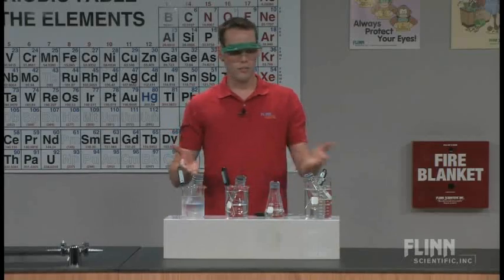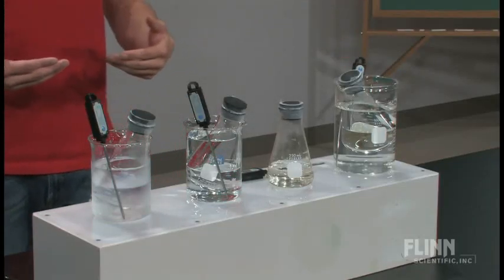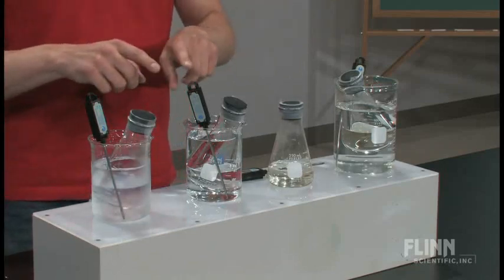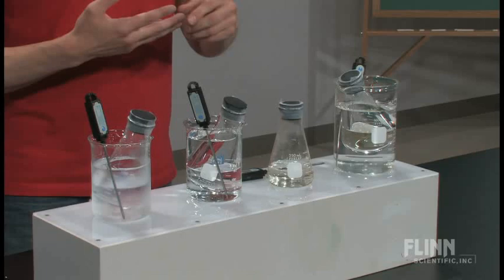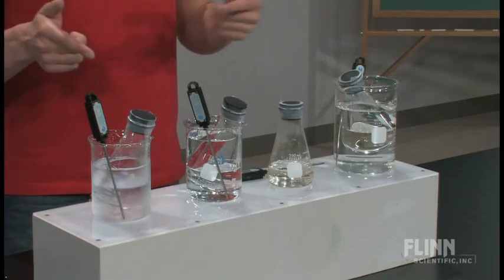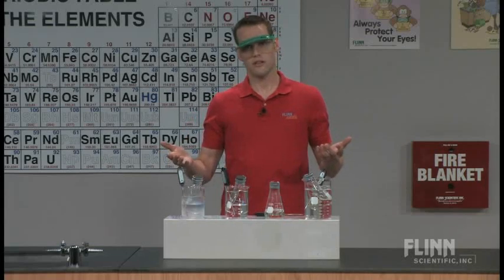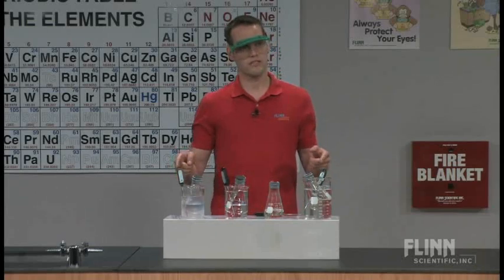What I have here are reactions that have already been prepared. I'll demonstrate them first, and I'll talk more about the chemistry in a little bit. But right now we have the same contents. We have some methylene blue, some potassium hydroxide, some dextrose, and just water in each one of these bottles. The same concentration of all solutes and all reagents is the same for every bottle. The only thing I've done different here, I have four different temperatures.